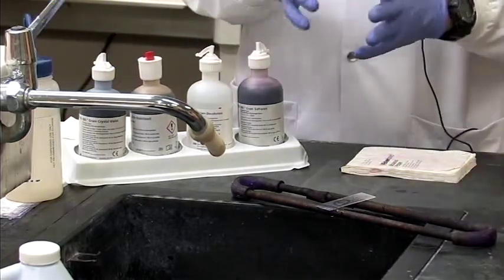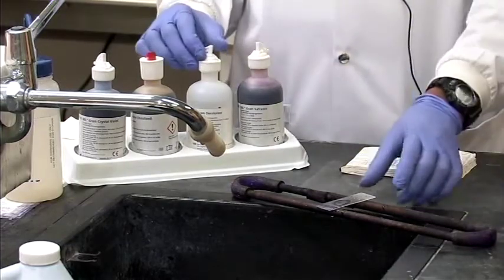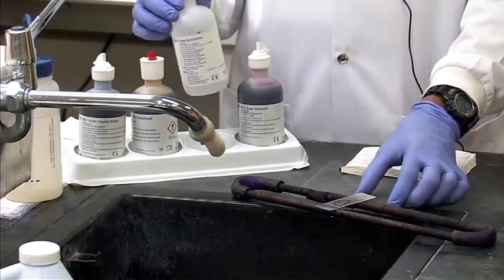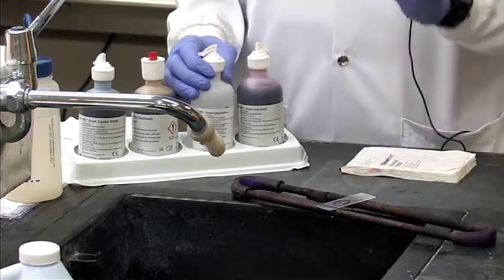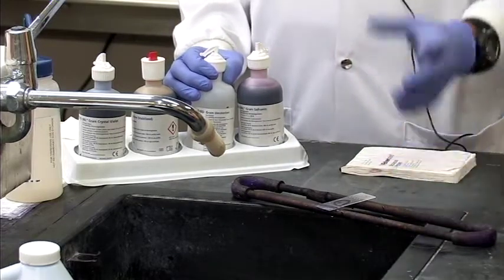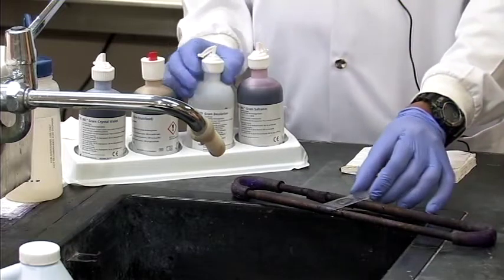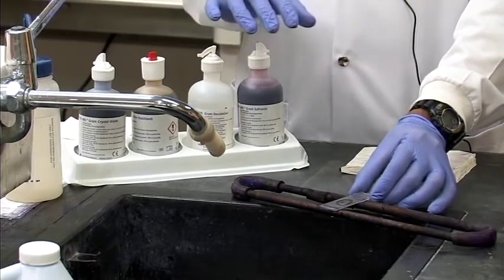So the gram-positive cell remains bluish-purple. The gram-negative cell, however, would be colorless because our decolorizer would have washed out that complex within the cell walls. And that is because it has a thin layer of peptidoglycan as its cellular wall structure. So the gram-positive now would be purplish. The gram-negative would be clear in color.